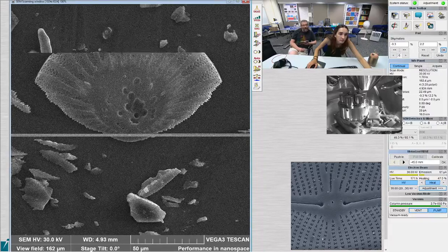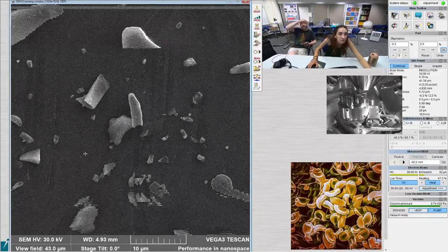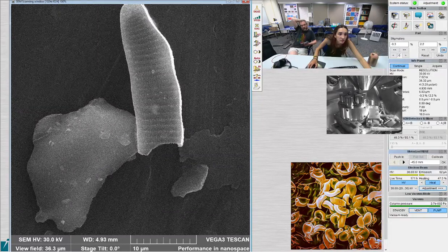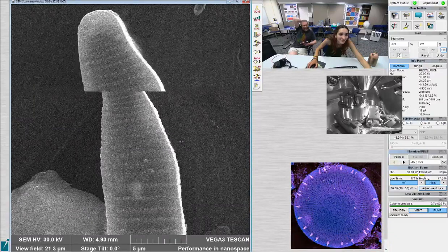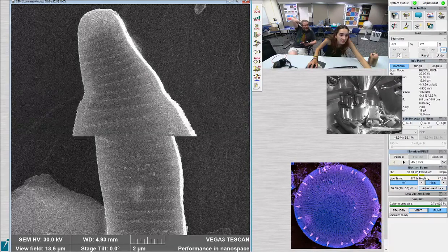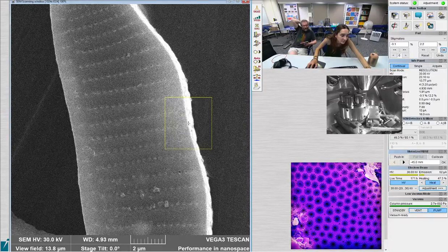That's weird. Oh, it is a diatom. Yeah. It's a little eunotia. Piece of... Yeah, you know for sure. Well, zoom in on that. Maybe it's not. I want to make sure. The ridges are areolae, so it is definitely a eunotia. Rather well-behaved eunotia.